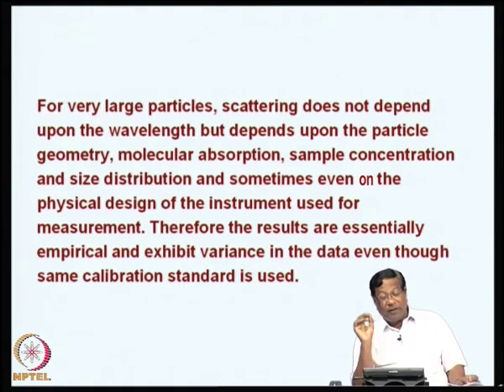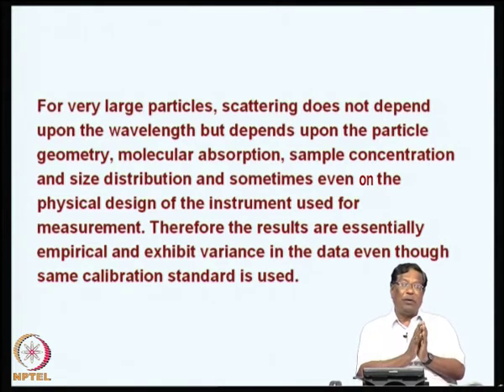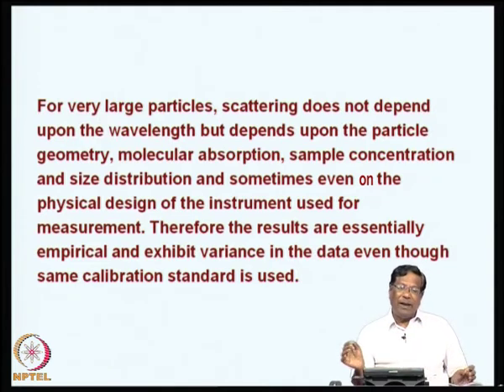Therefore, the results are mostly empirical in such cases. If the results are empirical, it means they are not exactly reproducible. Every time you do an experiment, the results will vary slightly.